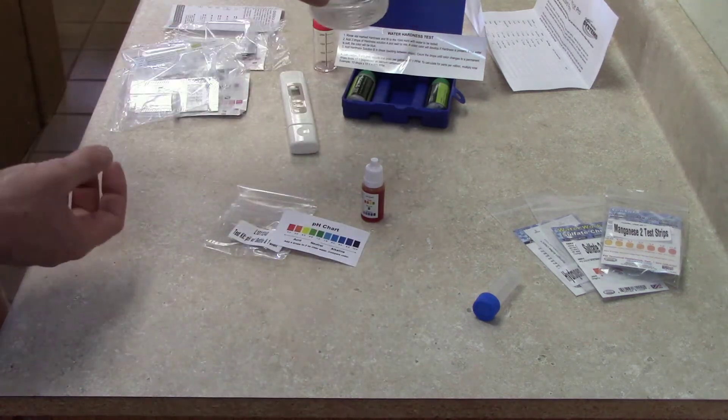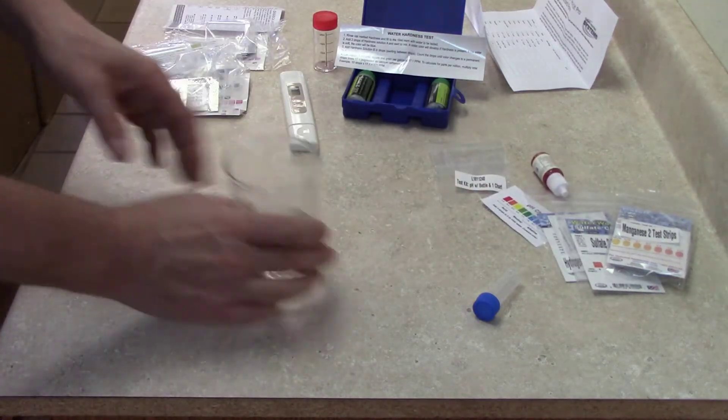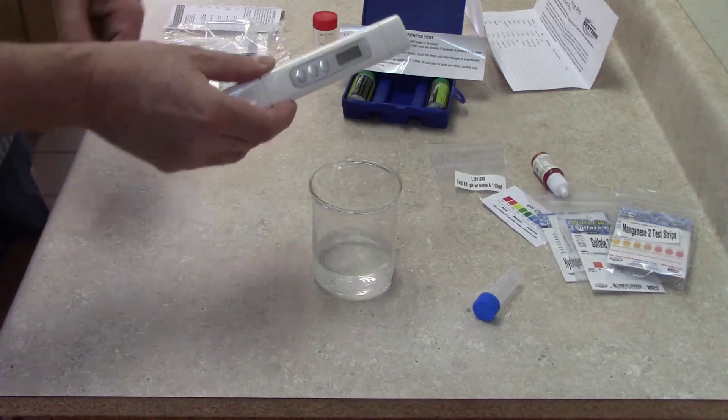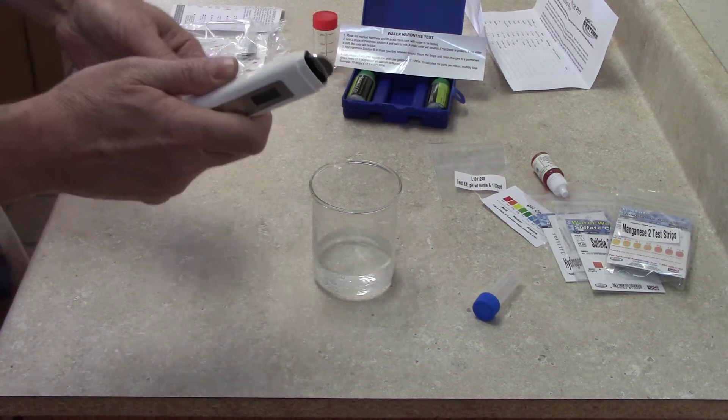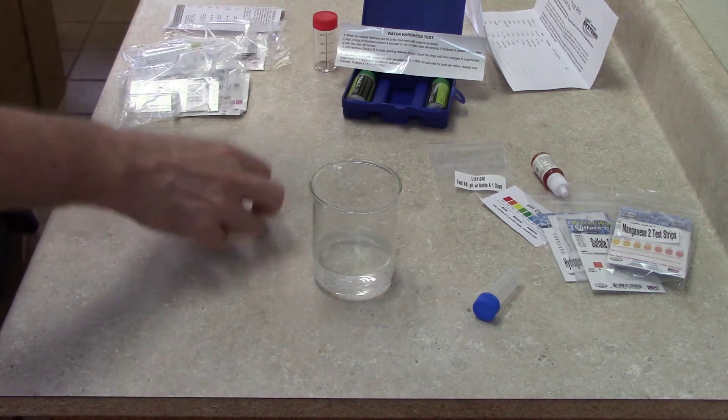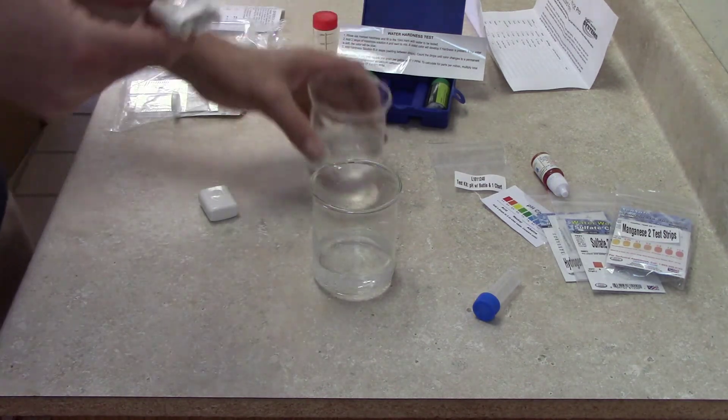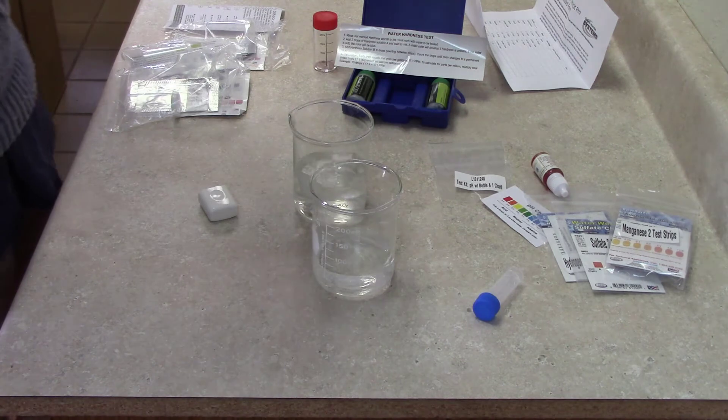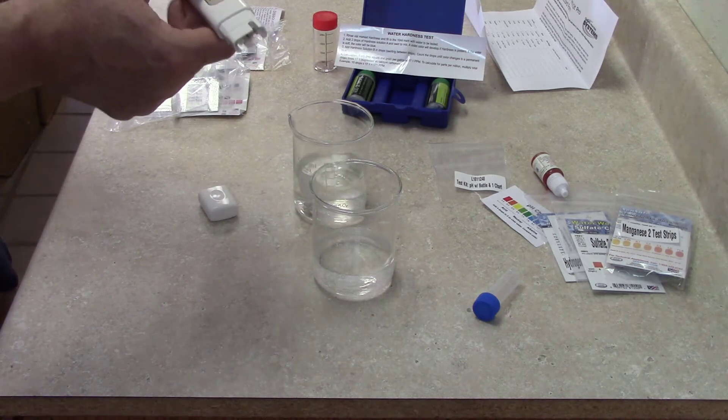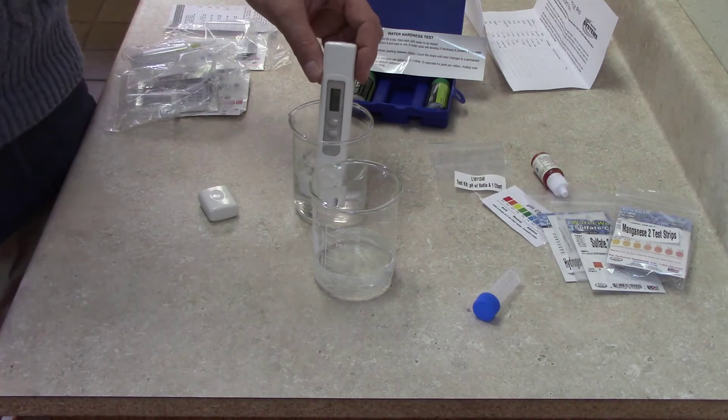The last thing we have in the test kit is the TDS meter. On one side when you open it, that's where the battery goes. On the other side is the probe that you'll stick into the water. It measures temperature and TDS - total dissolved solids, a measure of salts in the water. You turn it on and put it in the water to find out the TDS or temperature.